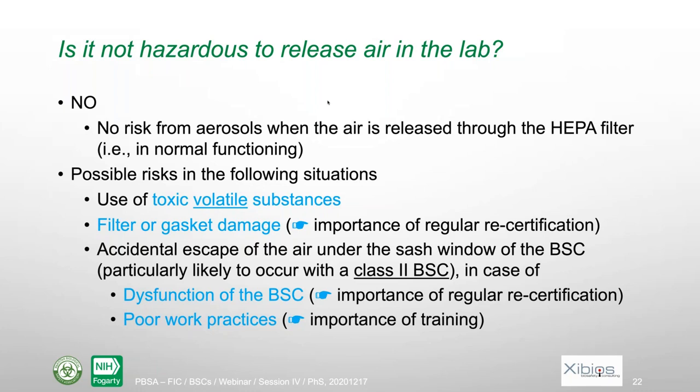A question was also, is it not hazardous to release air in the lab? Actually, no, at least when the biosafety cabinet is functioning properly. In that case, there is no risk from aerosols when the air is released through the HEPA filters. HEPA filters are there to retain the particles, so there is no infectious risk. But there are possible risks in some specific situations.